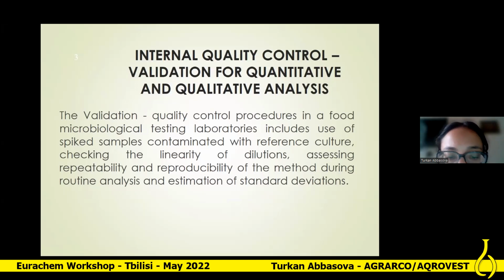As you know, internal and external quality controls should be carried out in the laboratory. What do the internal quality controls mean? It's the validation process. The process activities should be carried out in each laboratory, planned for the accreditation process to ensure the reliability of the results, and therefore the validation process should be carried out in each laboratory by the personnel who provide the testing.